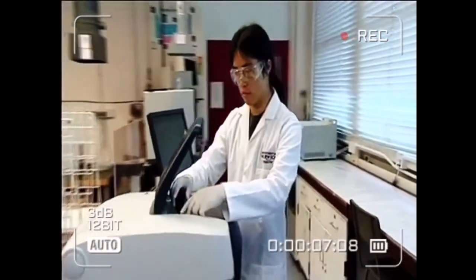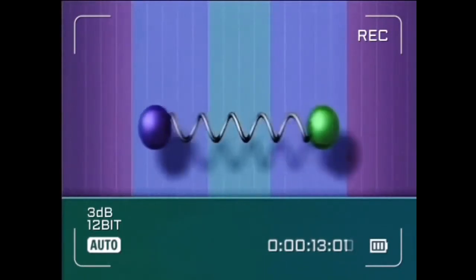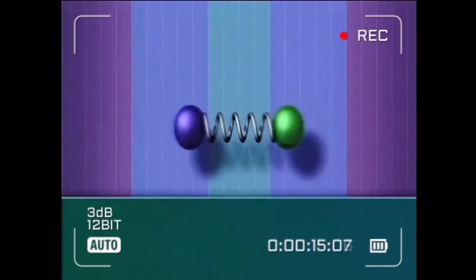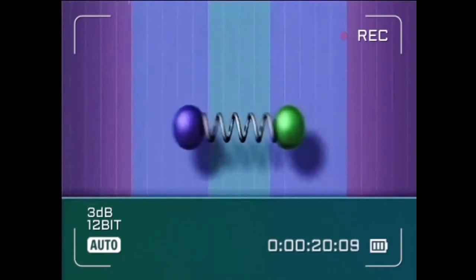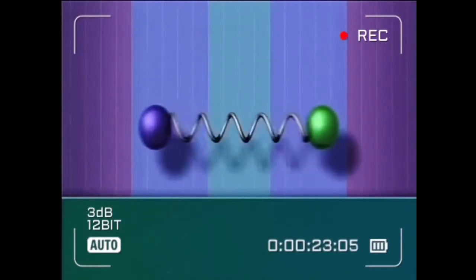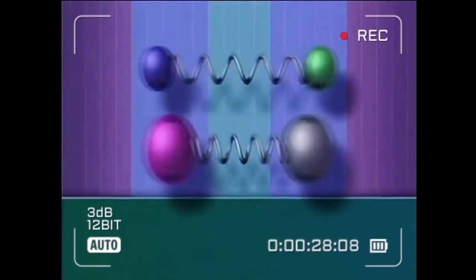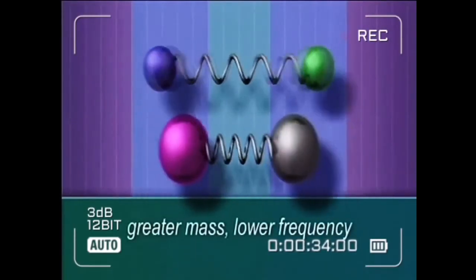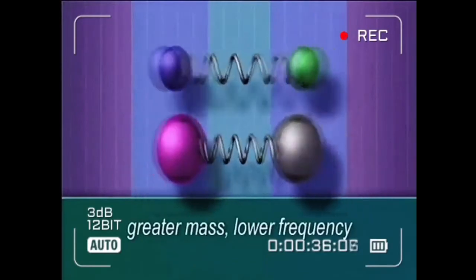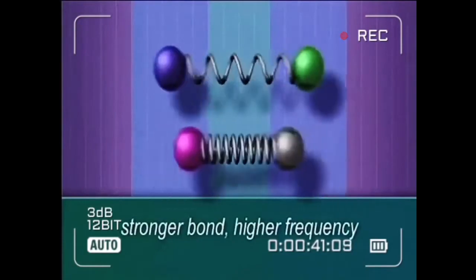Infrared spectroscopy helps chemists to identify the functional groups present in a compound. It can therefore help in finding the structure of the compound. A pair of atoms joined by a covalent bond can be thought of as being like balls on the ends of a vibrating spring. The bond can vibrate with different amounts of energy at a frequency that depends on the masses of the atoms and the strength of the bond. Light atoms give higher frequencies, heavy atoms move more slowly and so give lower frequencies. Stronger bonds give higher frequencies, weaker bonds give lower ones.